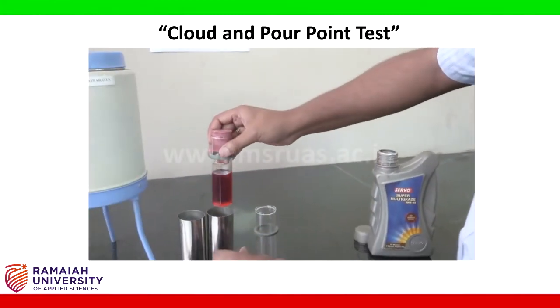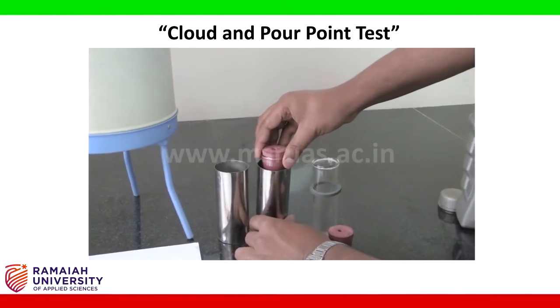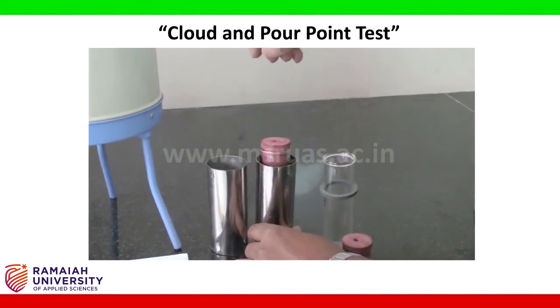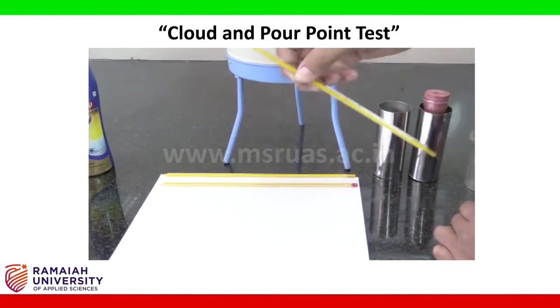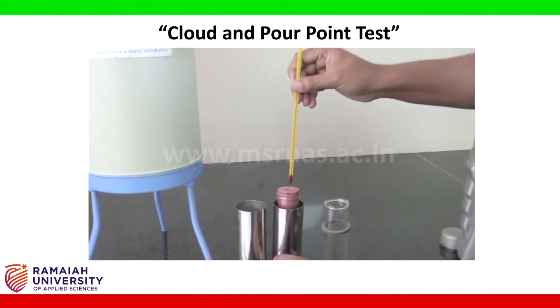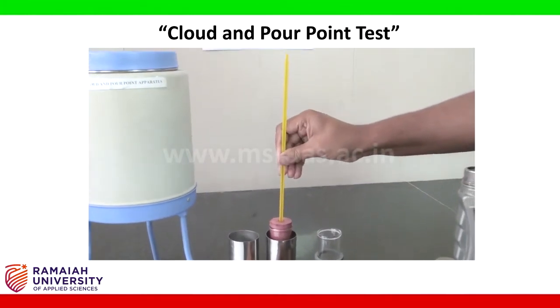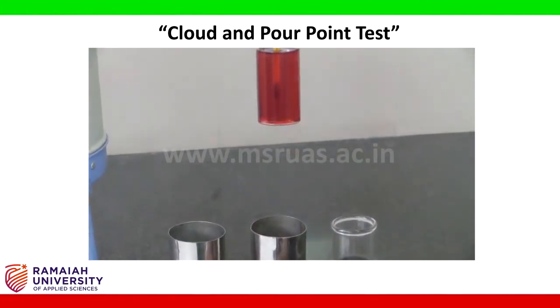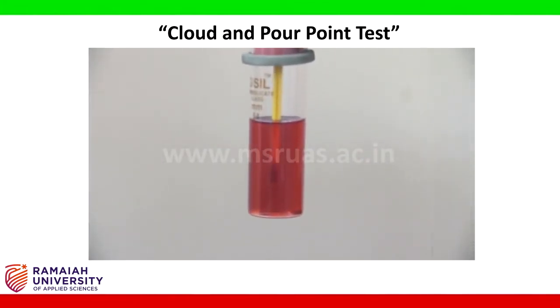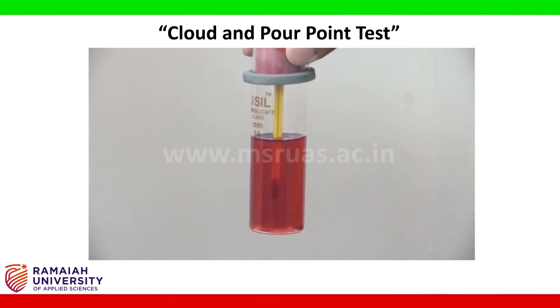Position the test tube in a test tube holder. And position the thermometer. See that the thermometer is positioned like this, straight and not touching any of the surfaces.